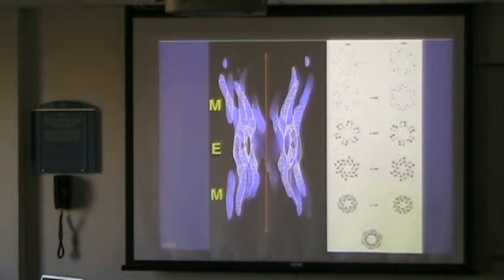And you see now what that means in the structure: this orientation is pretty badly resolved, while this orientation is pretty well resolved. That's the missing wedge. It's like a chewing gum, you know. In the Z direction you lose quite a bit of resolution. With 60 degrees you lose about a factor of 1.5. So if you have 3 in X and Y, you have about 4.5 in Z.